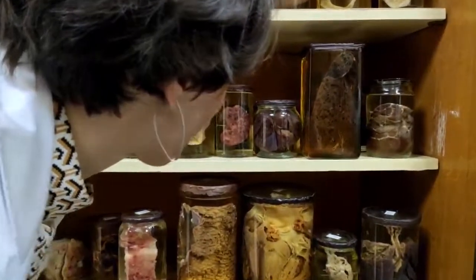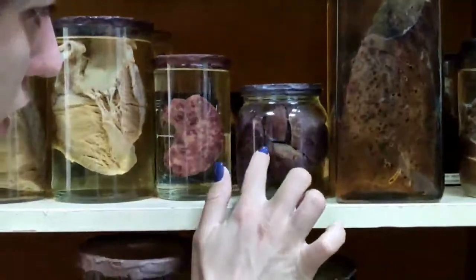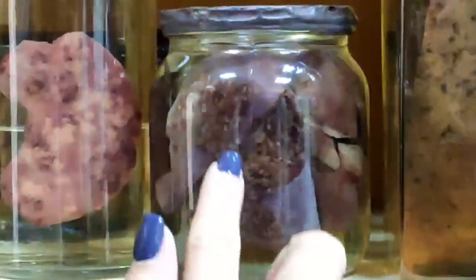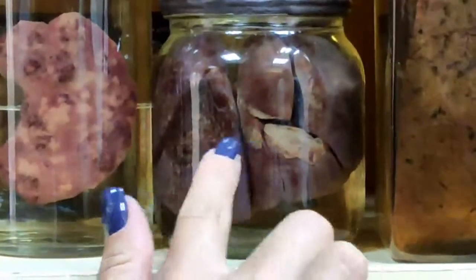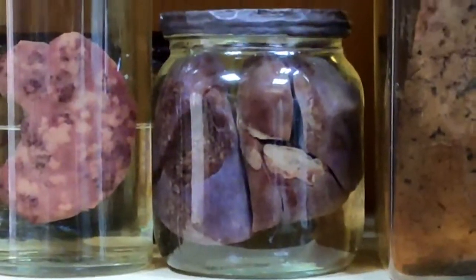Okay, the next one, I guess it's fibrinous pleuritis, and also we'll see a lot of zones of infiltration here. I should check what it is, but I guess that this is pneumonia, focal pneumonia. I guess so. I will check.